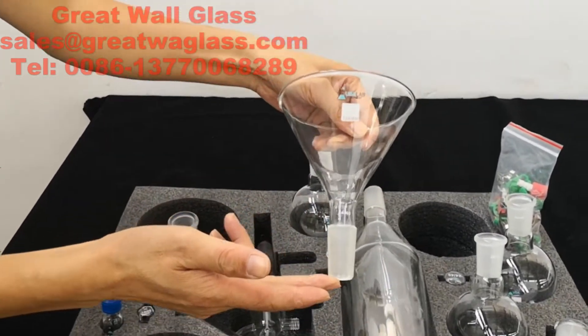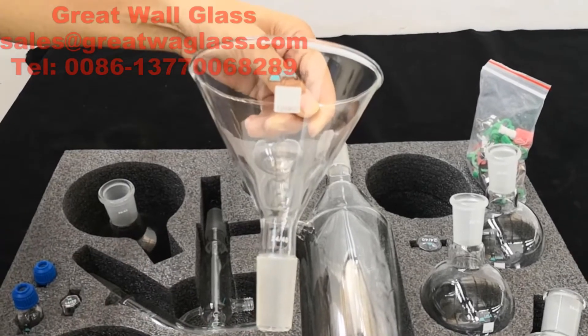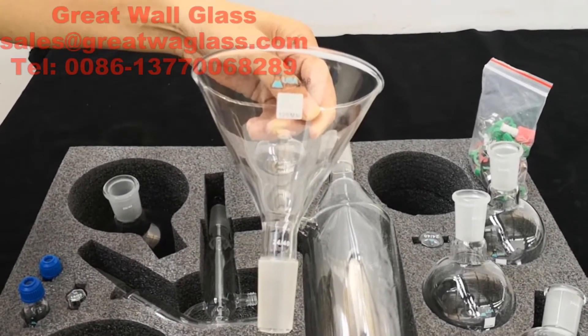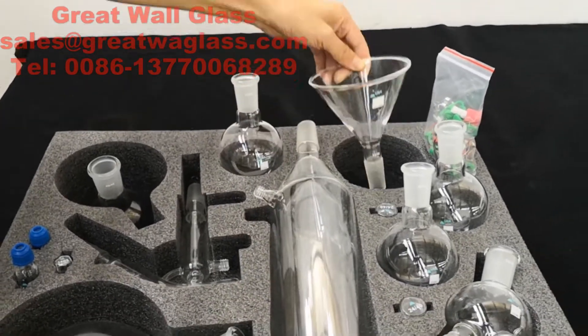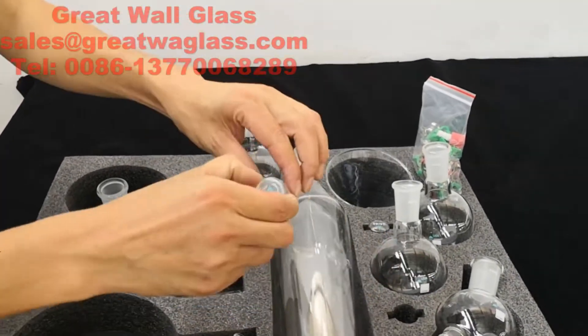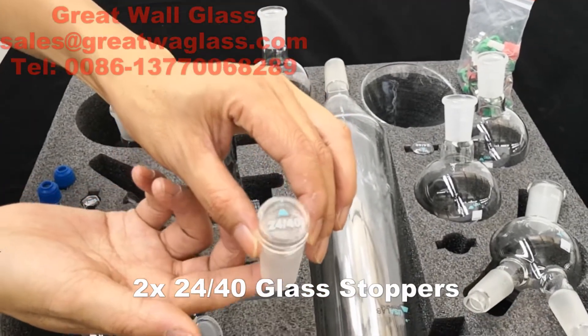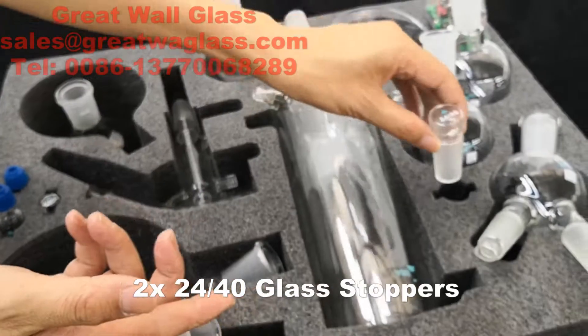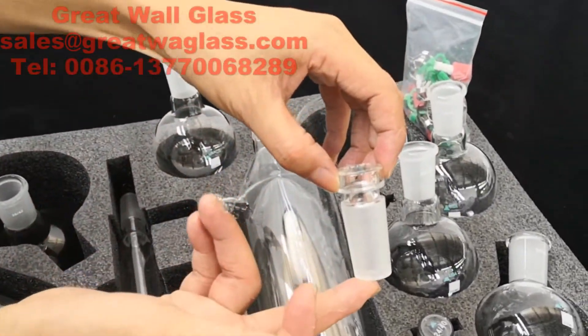One piece of powder funnel, size 120 millimeters. Two pieces of glass stopcocks.